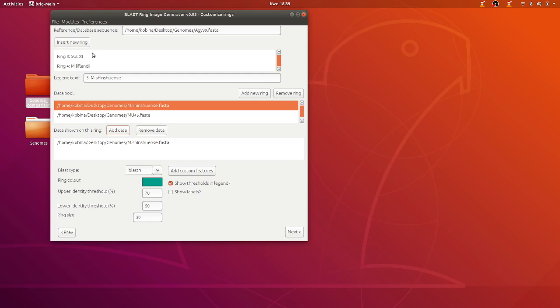Okay, let's make sure we have everything set up properly.